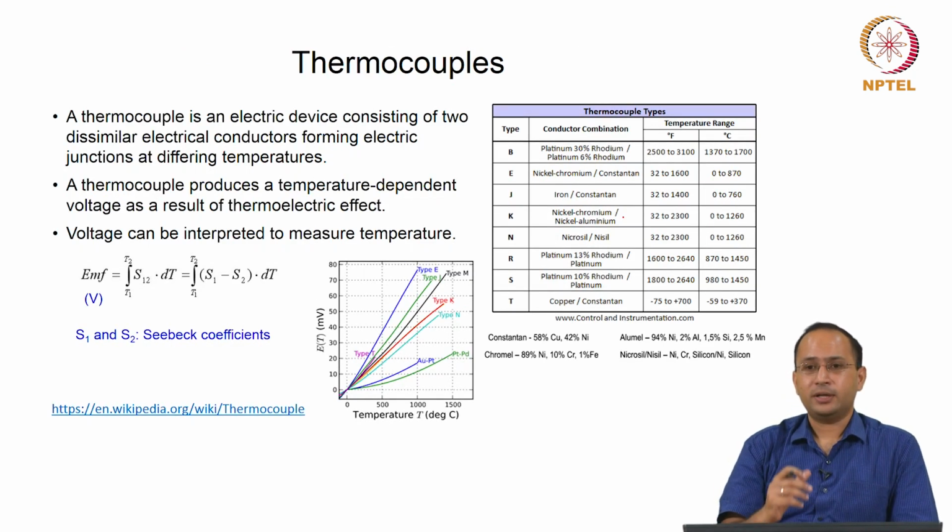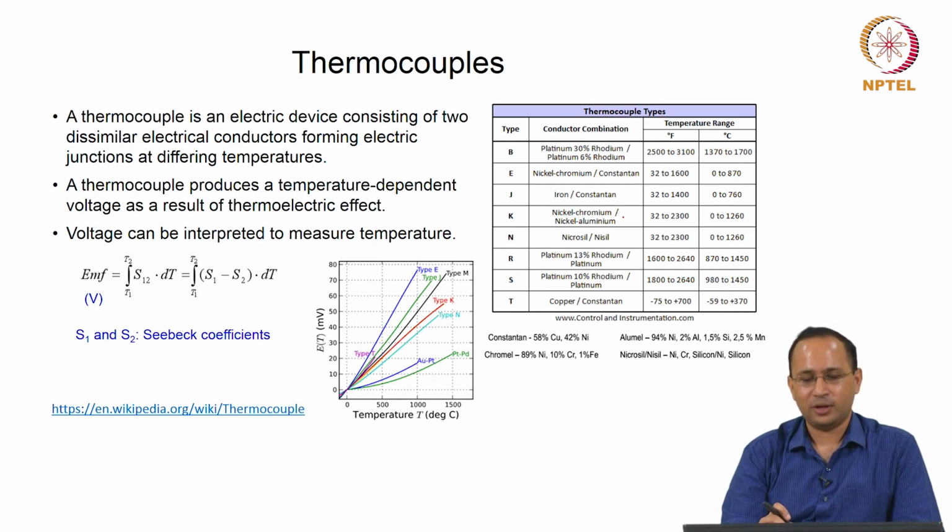Now, we talked about how we are interested in measuring temperature. So, it is important to understand the principle of thermocouples. Thermocouples are used to measure the temperature, and there is something involved in that, right. It is not very easy to measure temperature, we are talking about 1000, 1500, 1600, 1700 degrees Celsius. What kind of thermocouple do you use? So, we will just go over some basics.